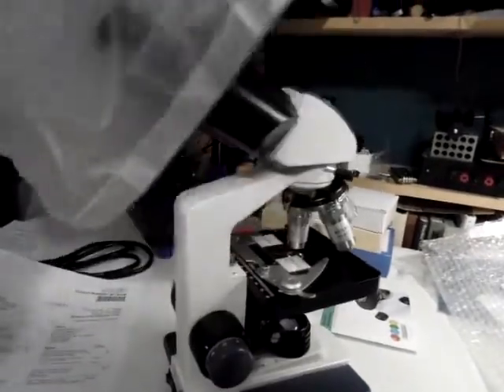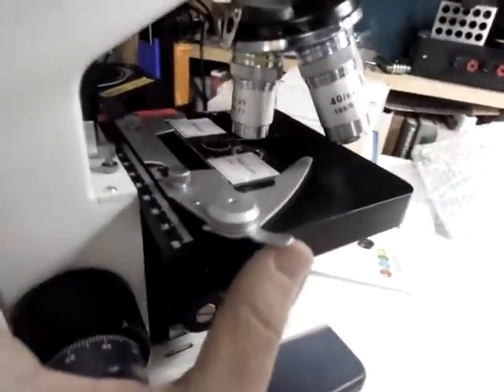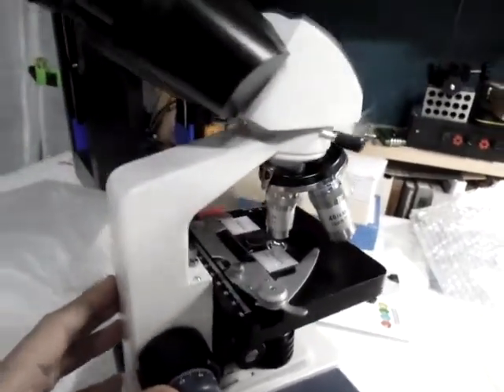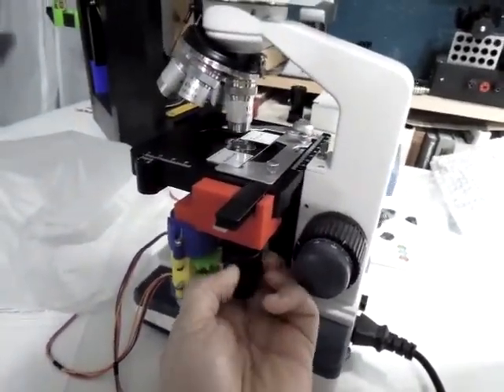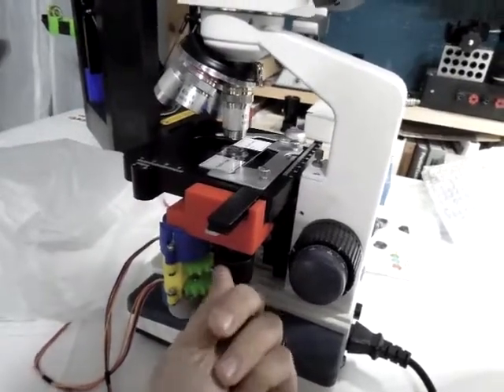The first one up is the bigger one. This is the B120 Series B, standing for Binocular Educational Microscope. It's got the nice little standard stage, which is nice. This one has an LED projector, so it doesn't get quite as hot. Here is the big reason why I got this particular scope: these two knobs here do X and Y. They move the stage that way, and they move the stage that way — this moves it on the X, this moves it on the Y.